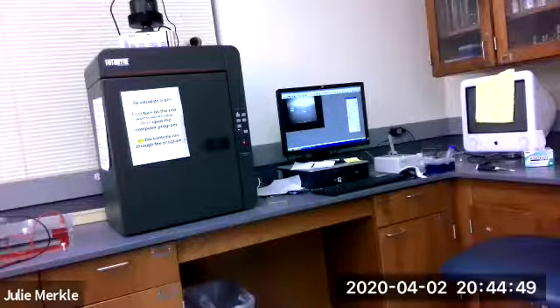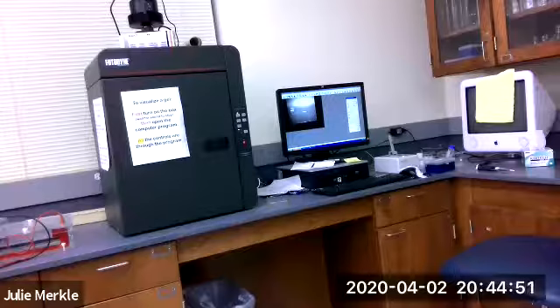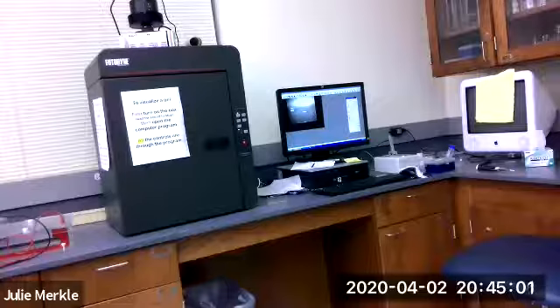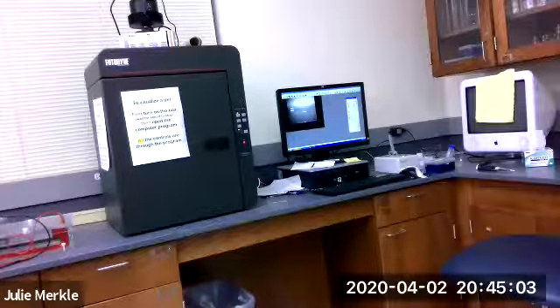The last thing is that I want to dispose of our waste properly. So since this gel has ethidium bromide in it, there's special waste in the hood where that ethidium bromide waste will go so that it does not mutate anyone.